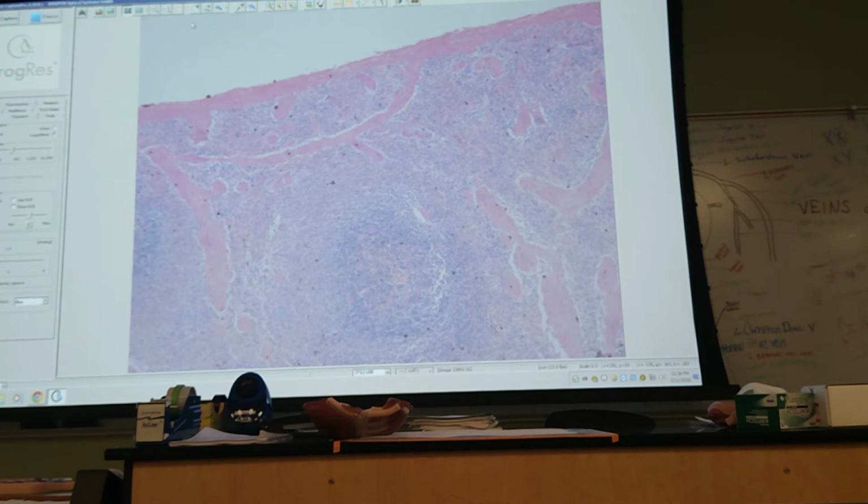Okay, so it has a basic structure. It is another structure that has a capsule. Okay, remember we've encountered capsule now. It's this outer connective tissue covering that surrounds the entire organ, and it's typically stained pinkish. Again, connective tissue type, and if we were completely bored, we could show it going all the way around. Okay? All right, so that's a capsule.